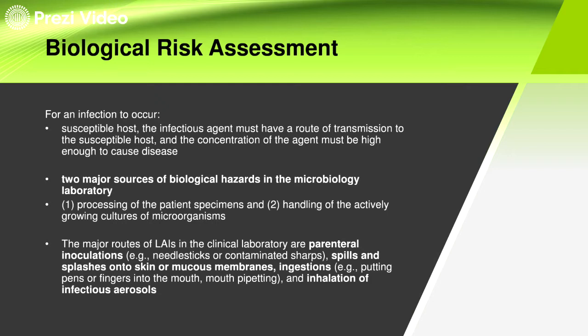It is actually part of our job. Tayo yung nagpapatubo ng mga bacteria. 'Di ba? So, kapag ikaw, iniisip mo na meron kang UTI, magpapagawa ka ng test known as urine culture. Okay? And then, do sa urine culture na yun, titinan doon kung ano ba yung bacteria na meron ka. Para makita mo kung ano yung bacteria na meron, dapat pinapatubo mo yung bacteria, pinaparami mo siya sa laboratory. So, yung mga growing cultures in the lab, plus yung specimen ng pasyente, ito yung major source of biological hazards in the laboratory. That's why we must always handle this properly.